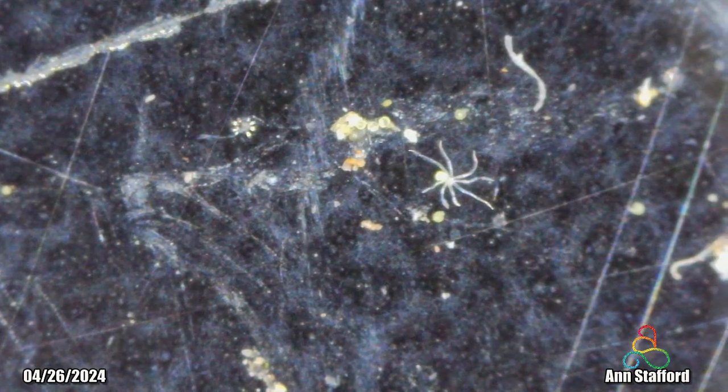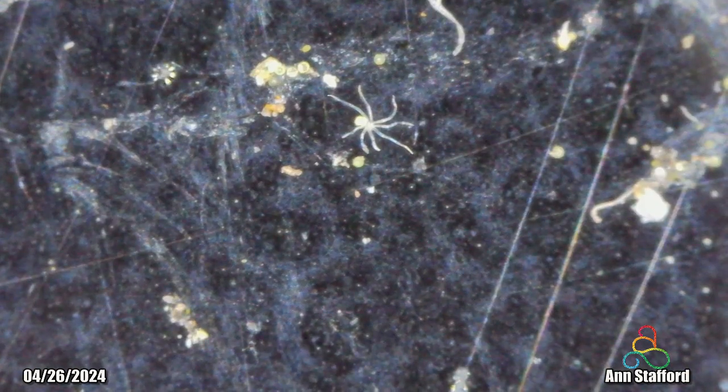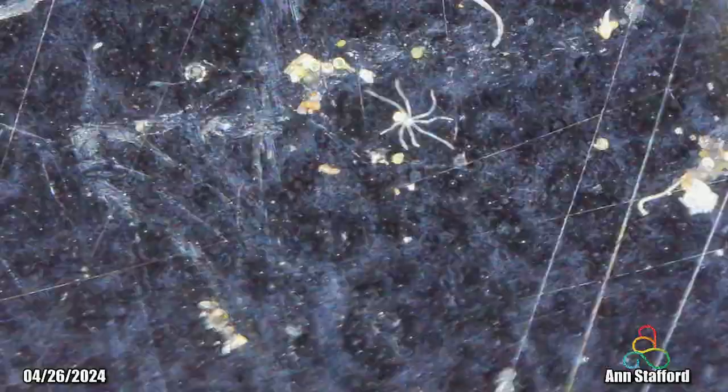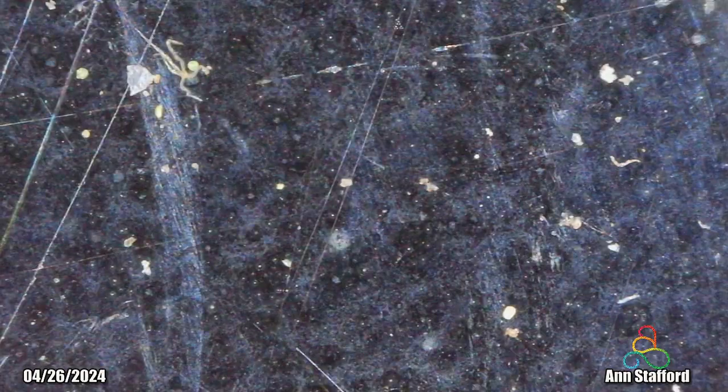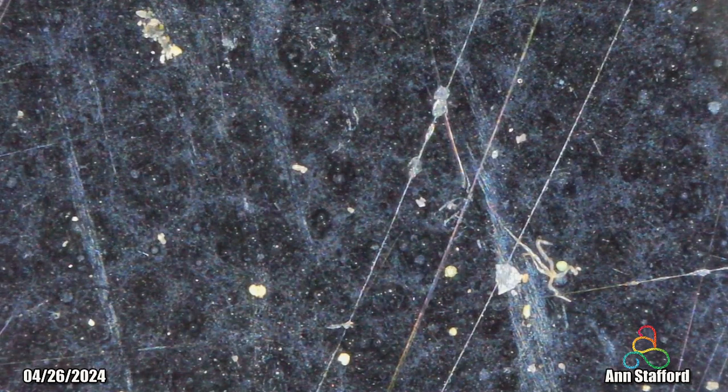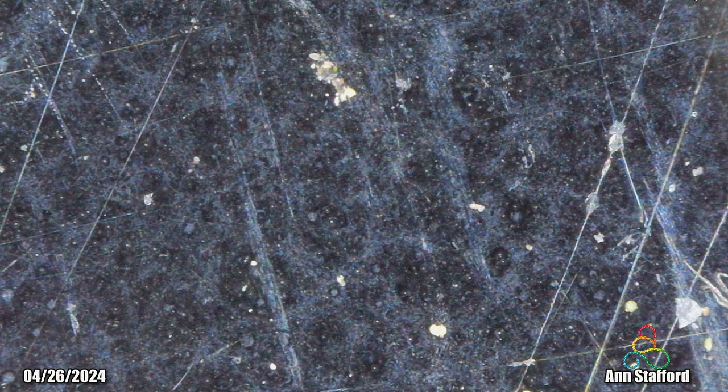Okay, so now the reason I think that there was this clump of them, there's another one. That one actually looks kind of like a spider, doesn't it? Some of them do look like spiders, but they're not spiders. Anyway, the reason I think that there was a little group of them is because this microscope has this little clear plastic guard thing between the lens and whatever surface you sit it against. And when you're pushing the microscope around the tray, I assume that some of this dust and stuff is sort of collecting and being pushed along with this thing.